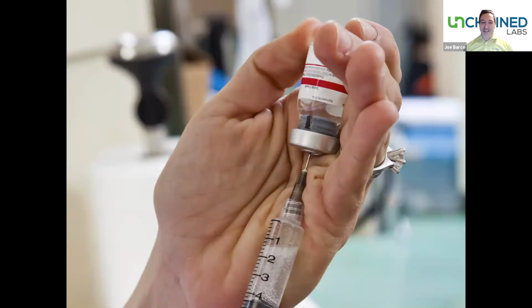If you're a scientist, you know how important technique is, especially if you want to really aggravate yourself, go look for pipetting stock photos, and you see how bad someone's technique is. But it doesn't take much to look at this treasure of an image and come up with everything that's wrong with it. So first, her hands are dirty. Second, I can actually see her hands being dirty because she's not wearing gloves.